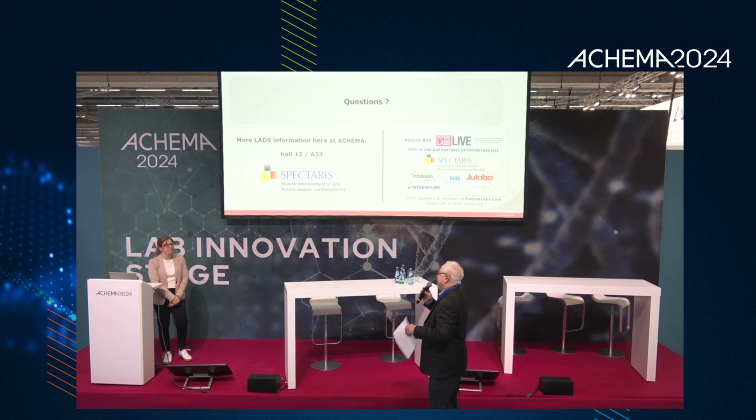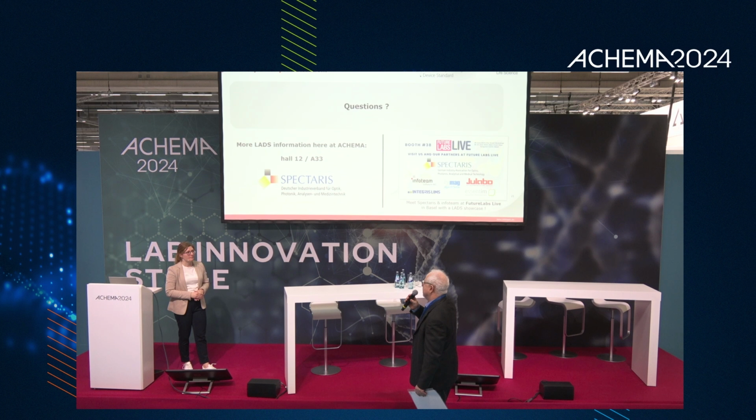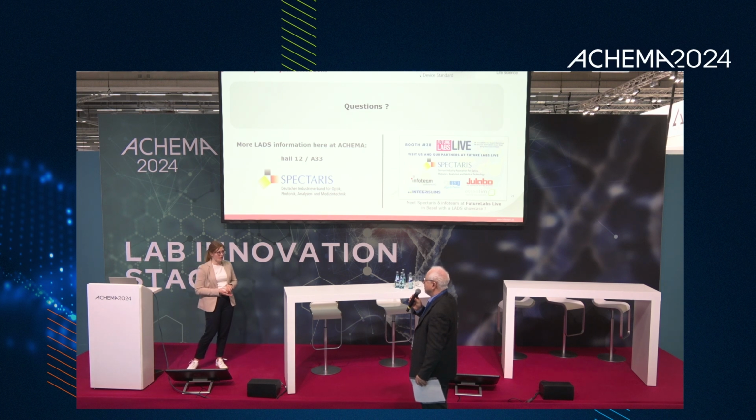But I have one question, because on one of your slides, it said that your solution can be easily integrated or made compliant with GMP requirements. How does it work? Does the software need to be certified somehow? Yeah, so the software needs to be certified. I mean, it supports functions like audit trails and data archival, electronic signatures, so that you can more easily stick to the GMP compliance.